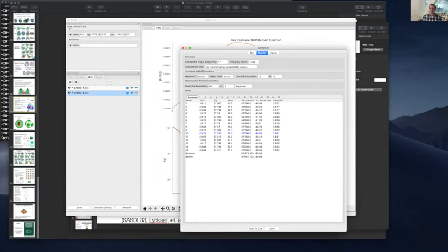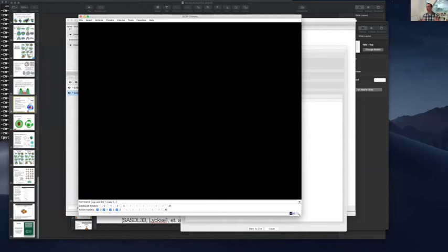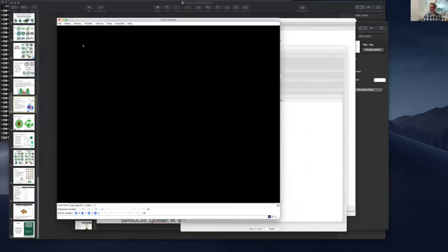All right, so what we're going to do is view these. I like to use Chimera to do this. Chimera is a great tool for visualizing these things. You can also use PyMOL, and you can also use Coot if you want to. But Chimera is great because there are functional tools built into it for doing things like model fitting. So the first thing we're going to do is load the bead model. Actually, let's start with density, because I think density is a little bit easier to understand, and then we can take another minute to do the bead model.